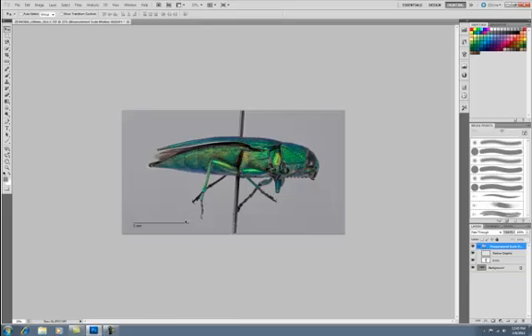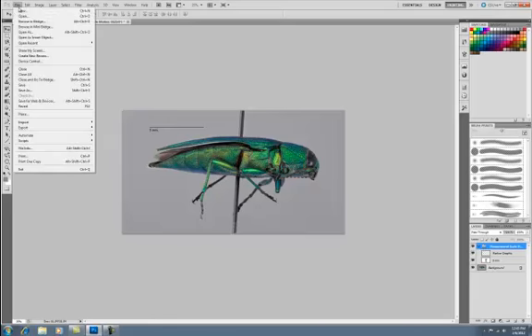And then to move the scale marker around, just click the Move tool in the side toolbar, click and drag, and then drag wherever you want. And it's important to not have it overlap with any part of the specimen, so that's why we keep it in the space above or the space below. So I like that, and now I'm going to save the image.